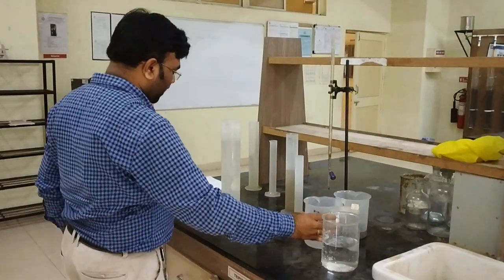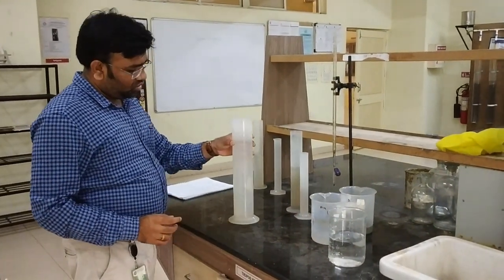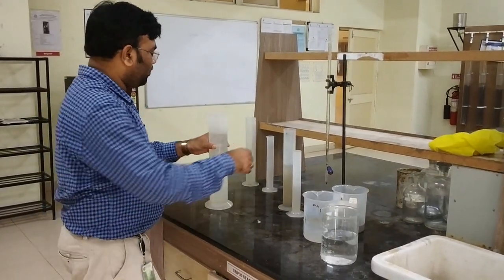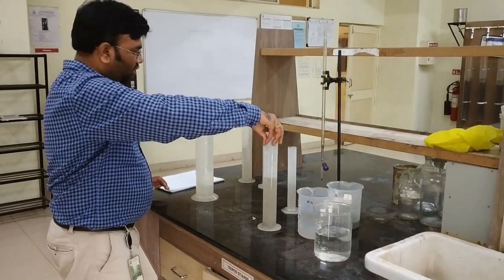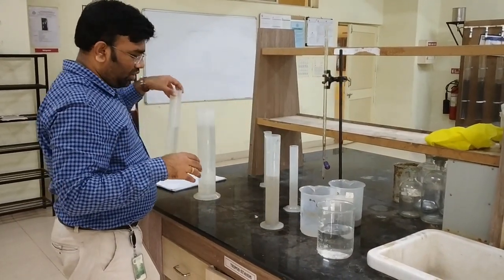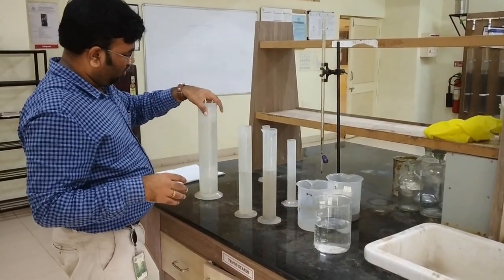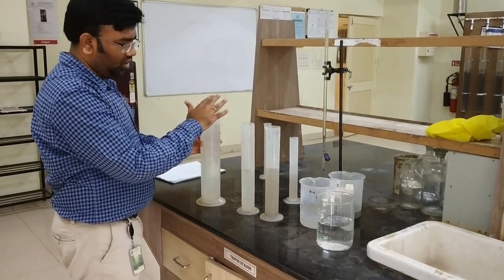Yes. So now what has happened is that we have made the dilution and achieved the dilution factor of 2000. How we have done so is that we have achieved firstly the dilution of 10 here, and after that again 10 here, and then we have achieved the dilution of 20 in this. So 10 into 10 is 100, 100 into 20 is 2000.